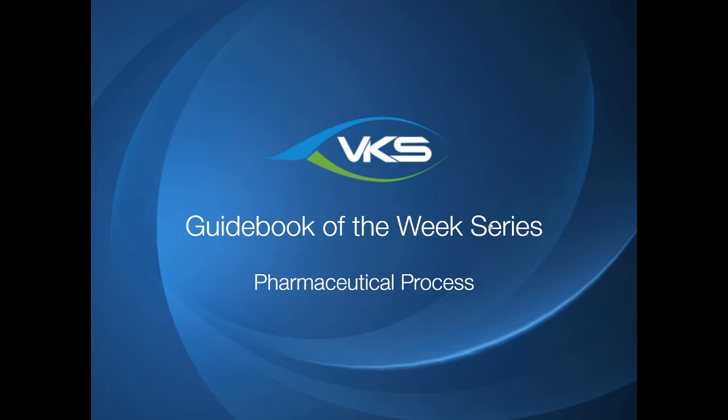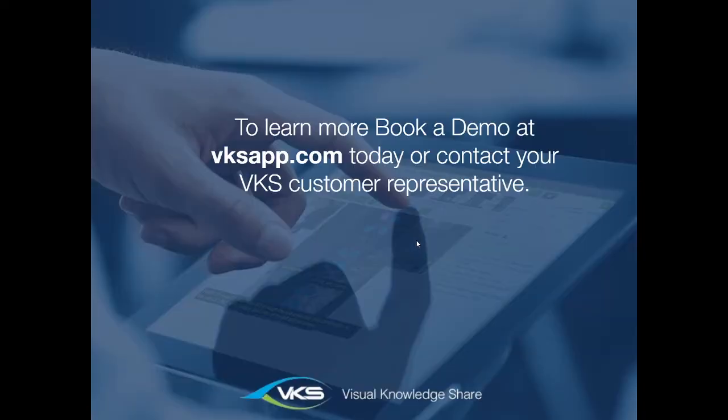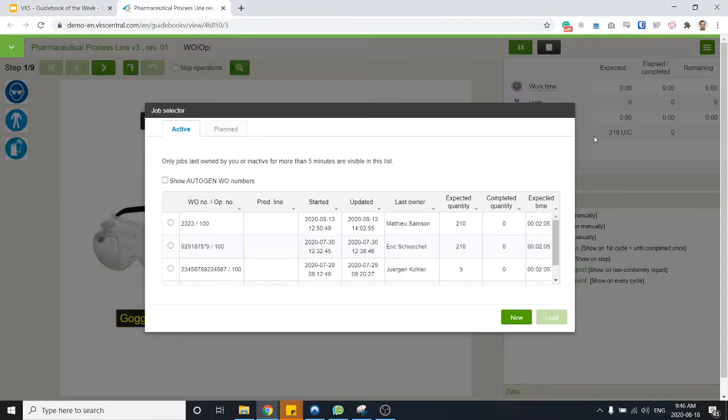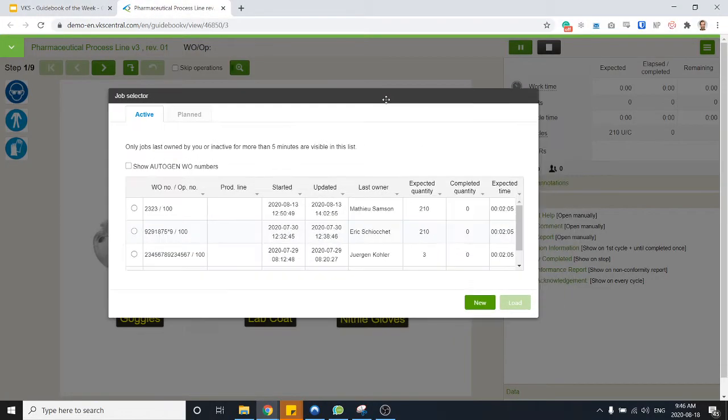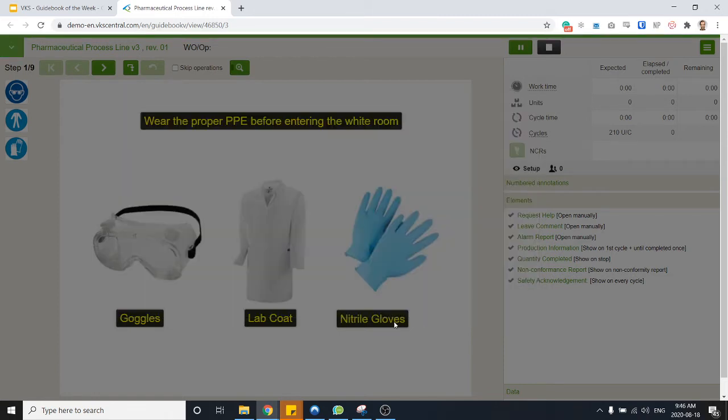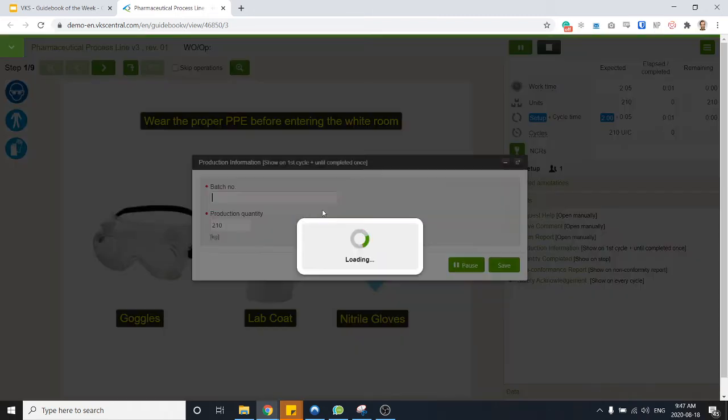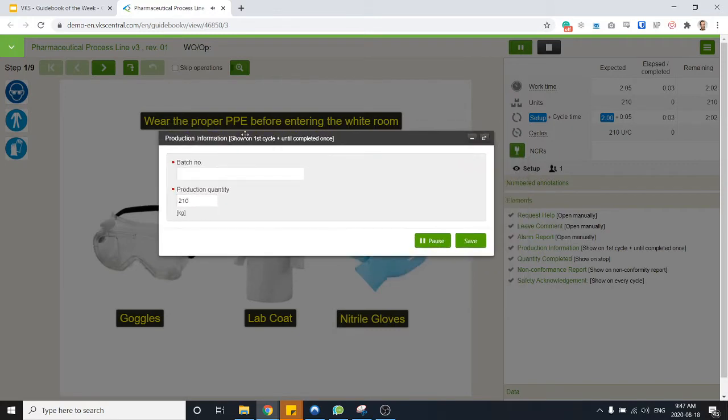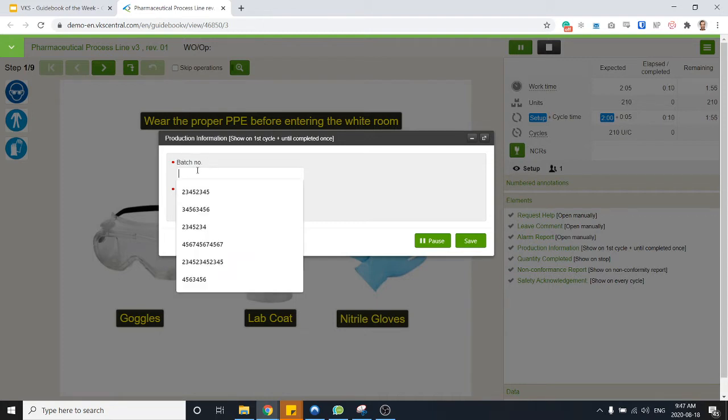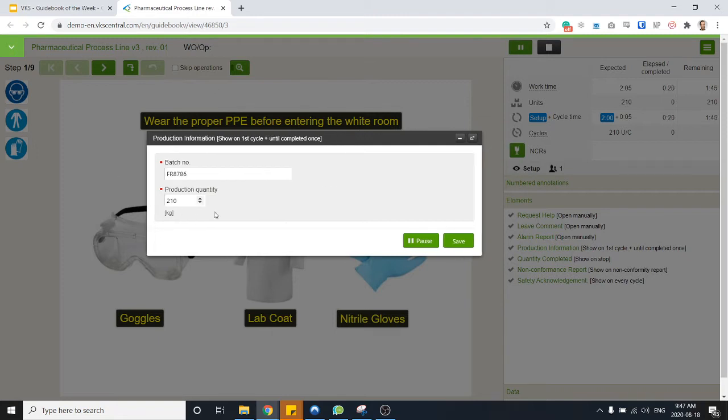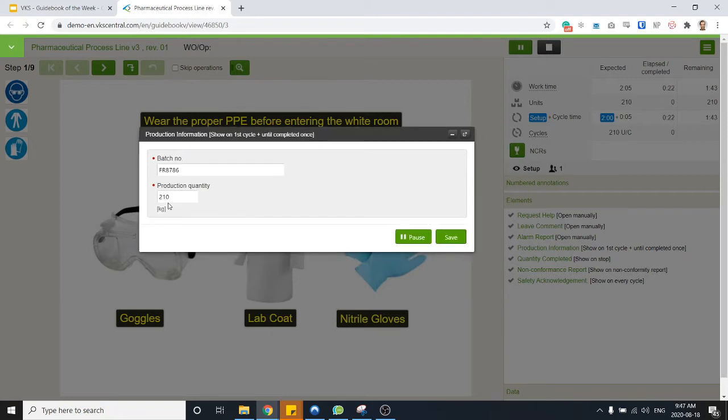So let's move right in there. Job selector, let's start a new job for now. So I'll hit new and first thing I've got my form here asking me which batch number I'm working on. Here I'll be working on this one for a production quantity of 210 kg which is already preset, so I assume that every time I run this batch it's for this weight.